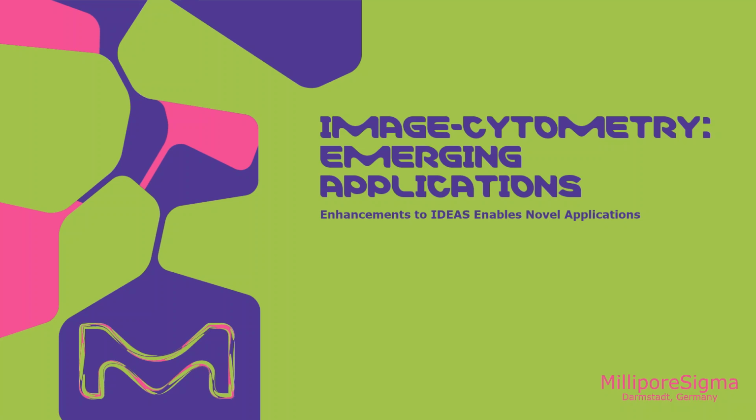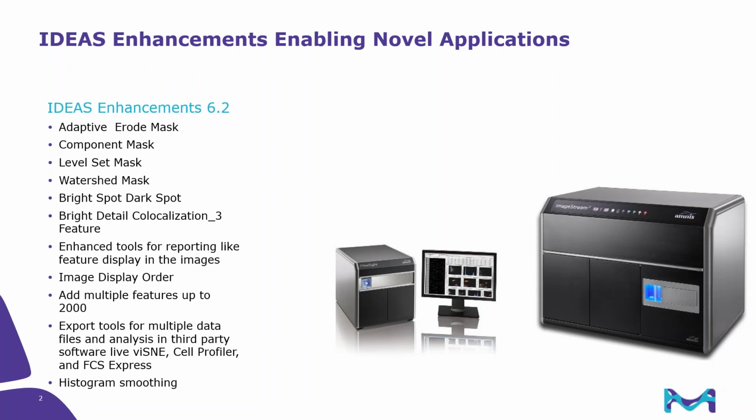And as Sean pointed out, we've been working with the Novo Software group and FCS Express to facilitate some of the batch reporting and make using the ImageStream much simpler, and especially when it comes to reporting your cytometry data. But we thought we would take this opportunity to go through some of the enhancements and some of the novel applications and new applications that we have coming out for the ImageStream.